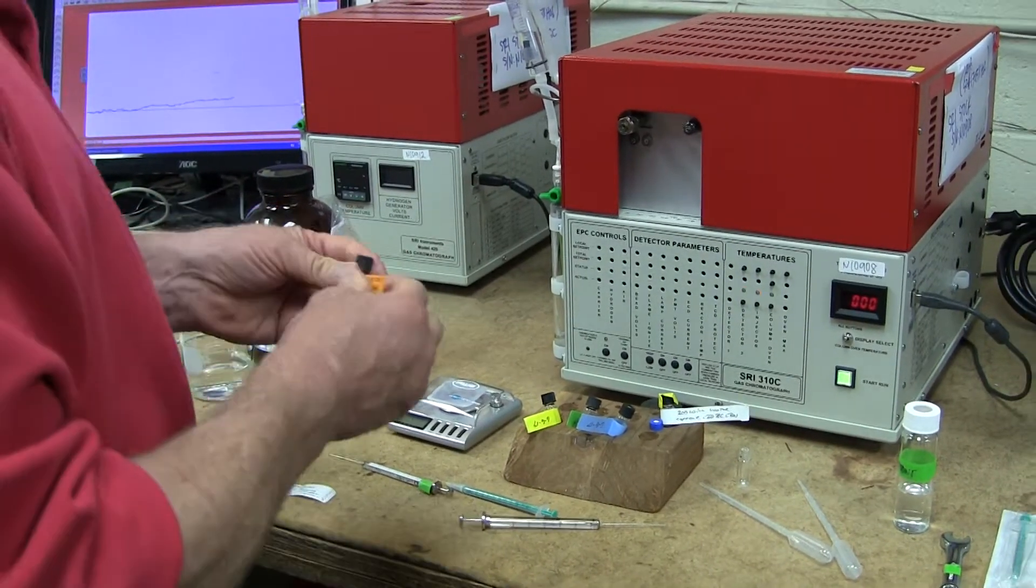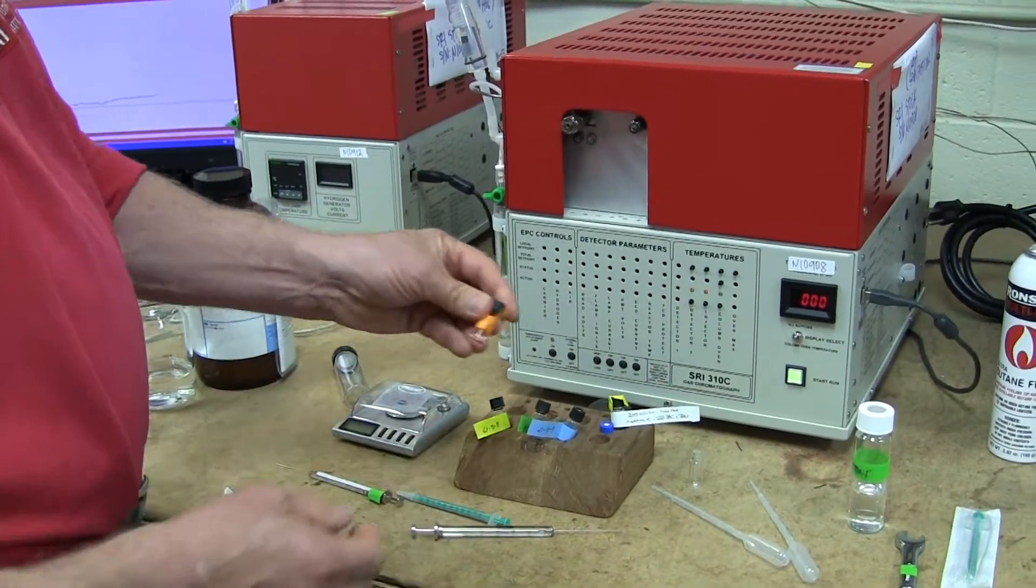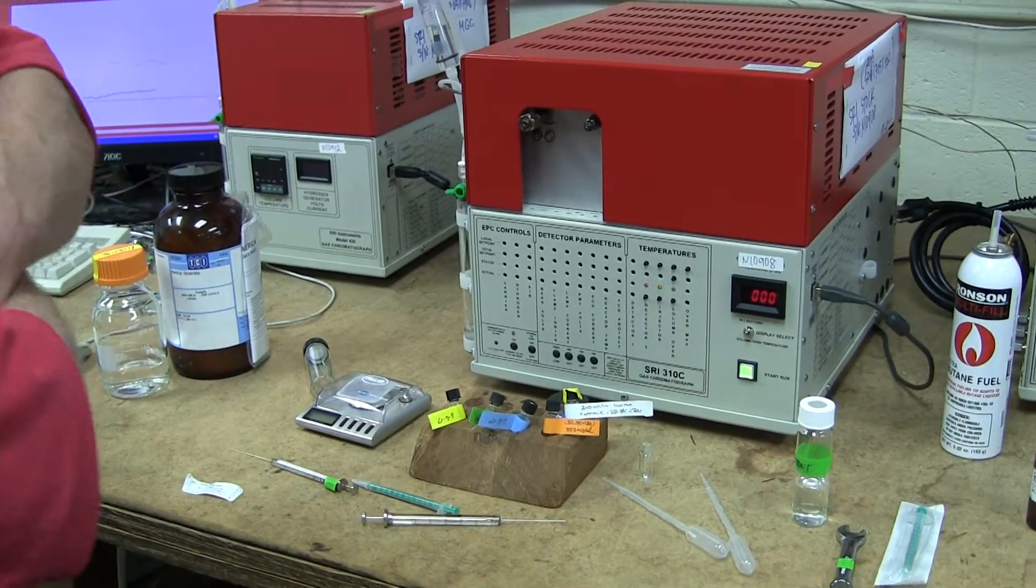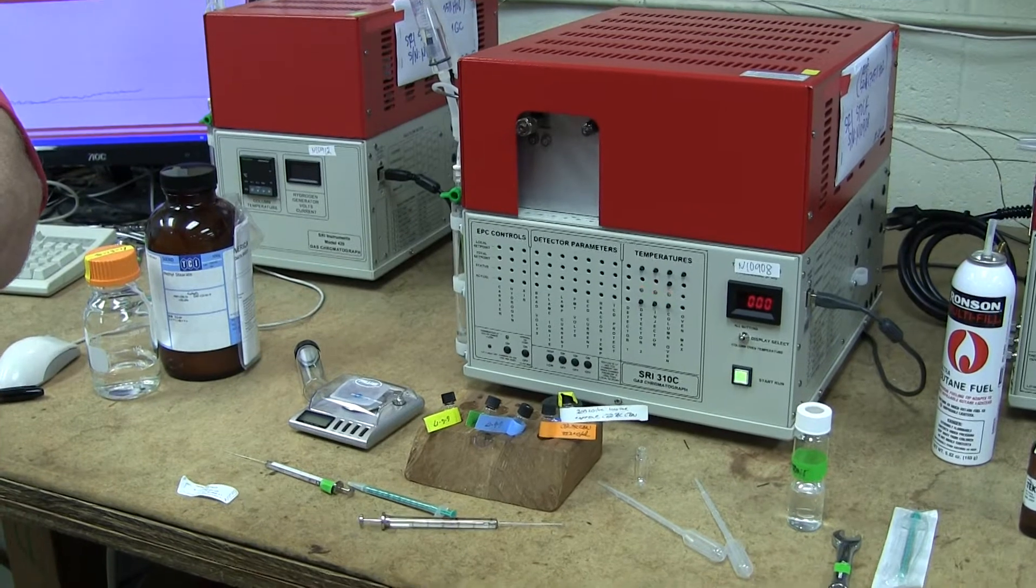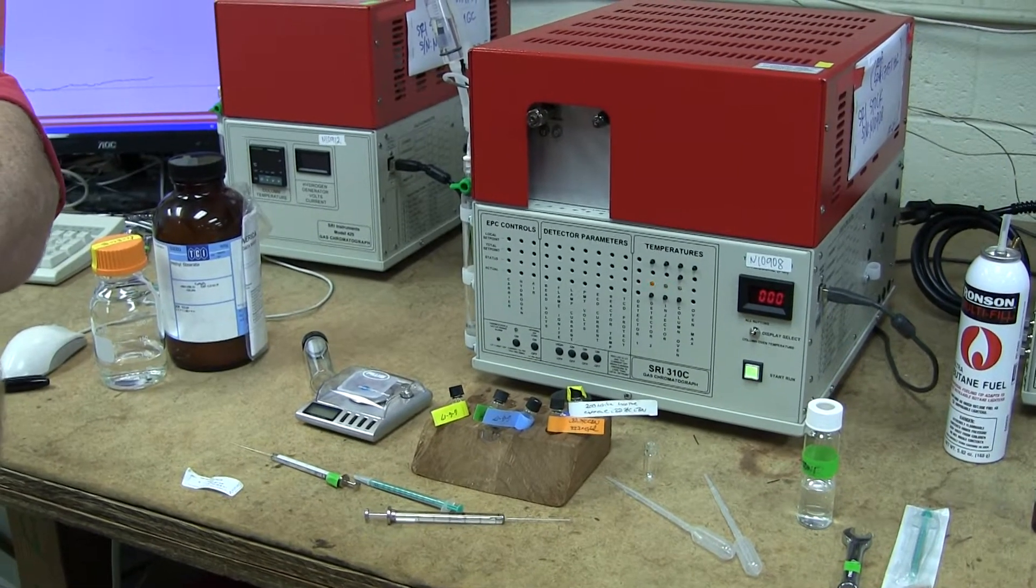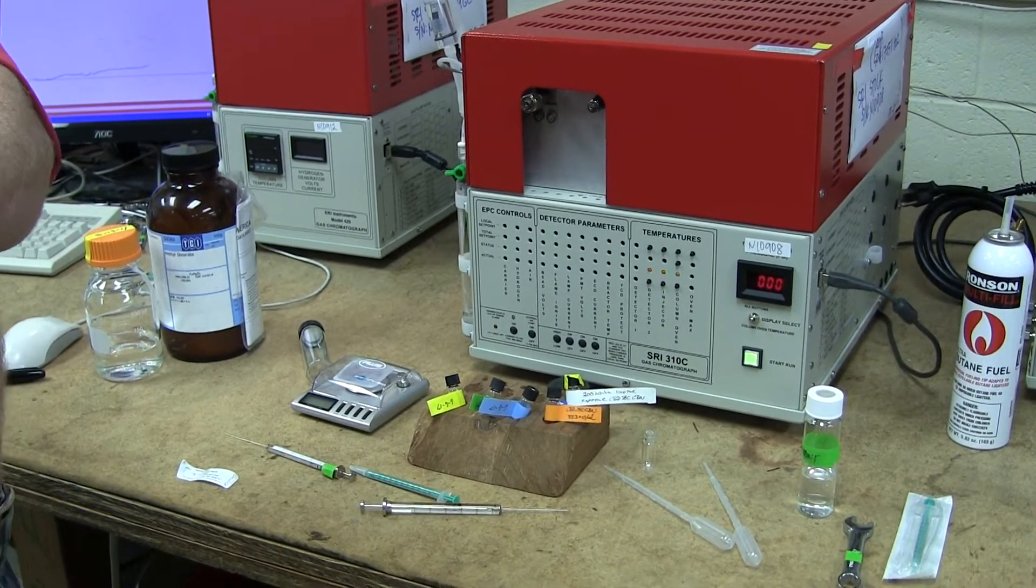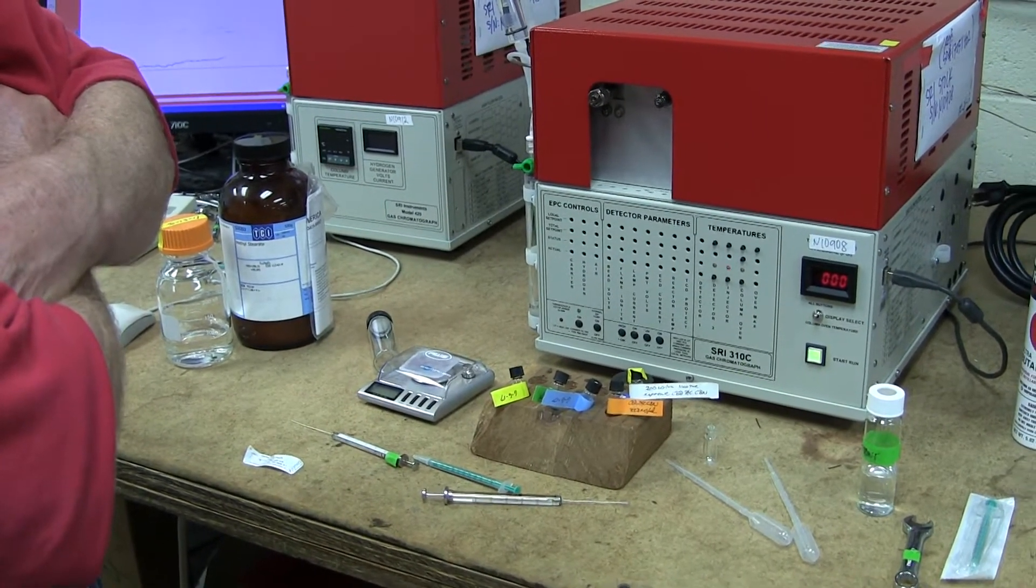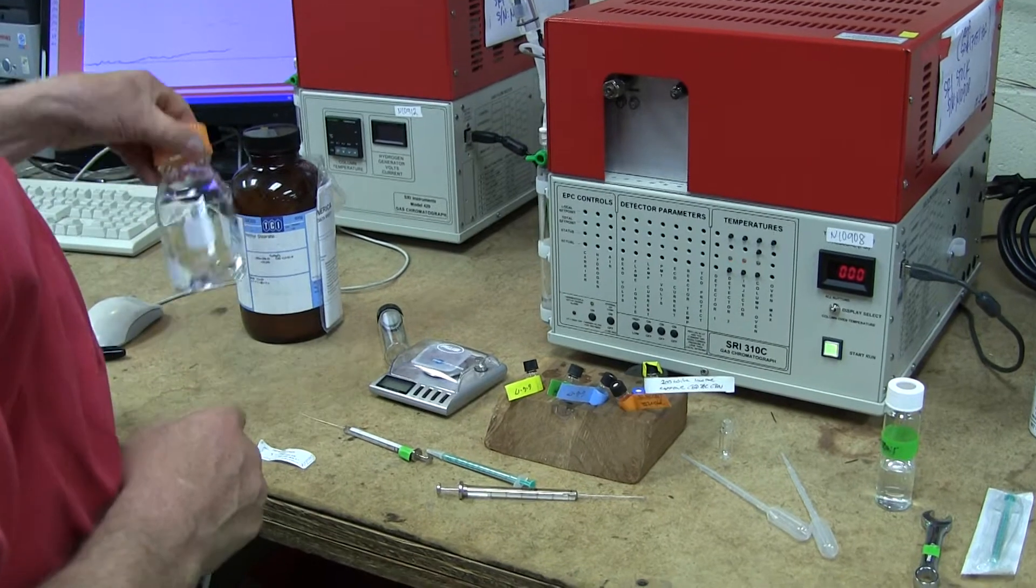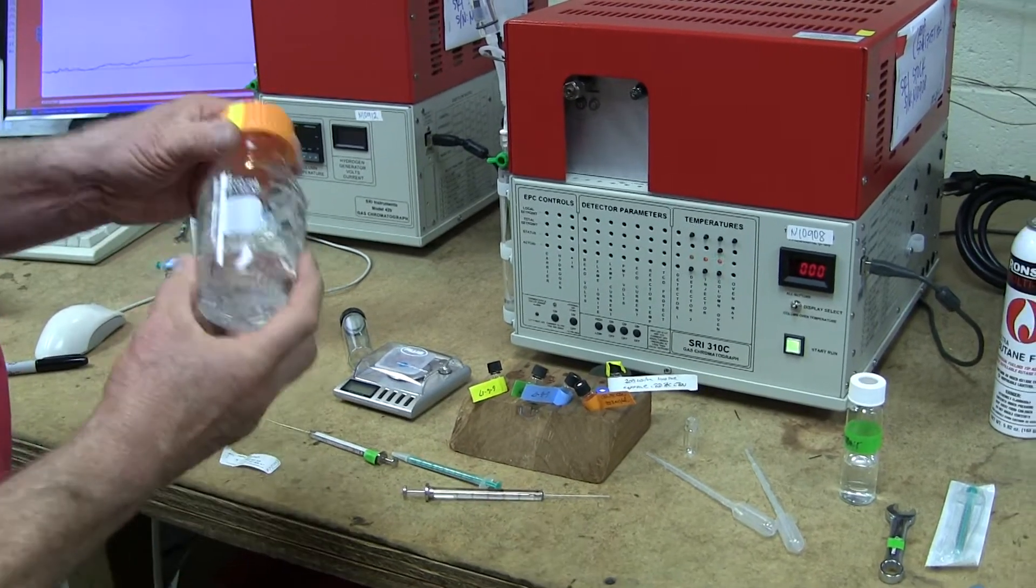So, you could use this, just like this, this would be called the working standard if you were using the external standard method of calibration. But we are going to use the internal standard method of calibration. So for that, we need to have an internal standard solution, which we happen to have here. And what this liquid is, is acetone from the hardware store, and this costs about $12 a gallon.